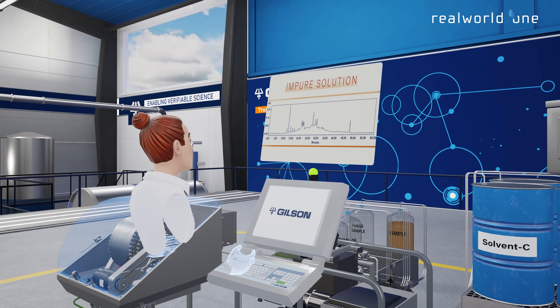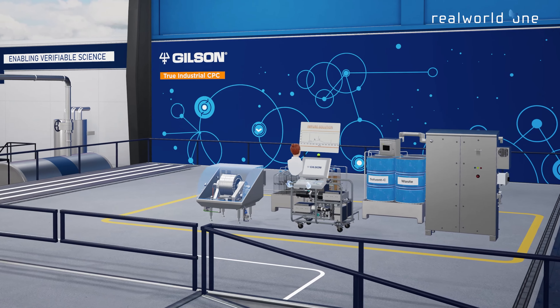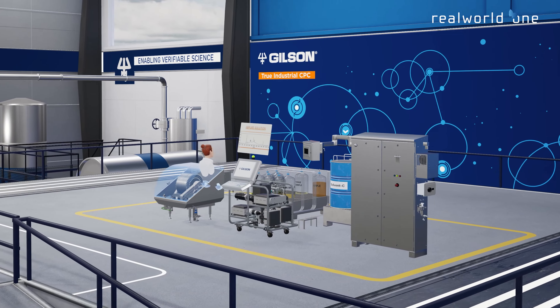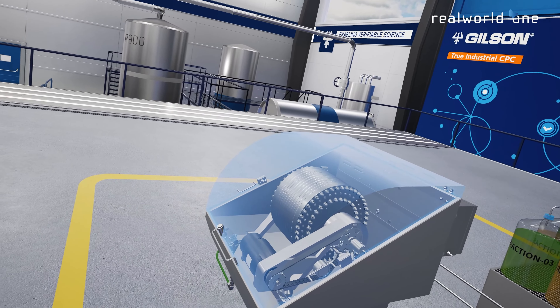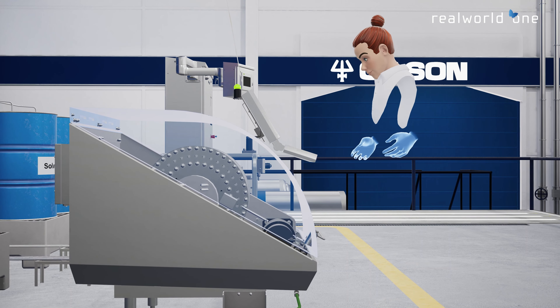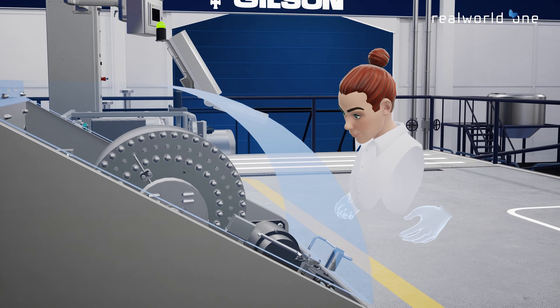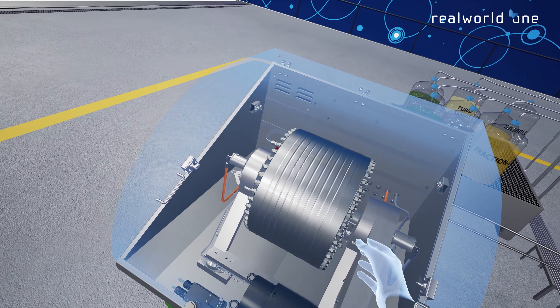The molecular separation process on a CPC chromatographic column is launched from the Verity SCIDS PC. The Verity CPC Process System's customizable rotor benefits from a new cell design and rotation speeds ranging from 100 to 1,800 rounds per minute, allowing for processing several tons of samples per year with higher resolution.